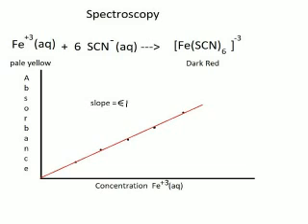We can then draw a straight line through our data points and the origin, and the slope of this line will simply be equal to the extinction coefficient times the path length. And so we'll now have epsilon L for doing our calculation. Then, using this graph, we can take the absorbance of our unknown solution and see where it falls on the slope of our line, and from that we can deduce what the concentration of iron plus 3 is in our unknown solution, thus finishing the experiment.